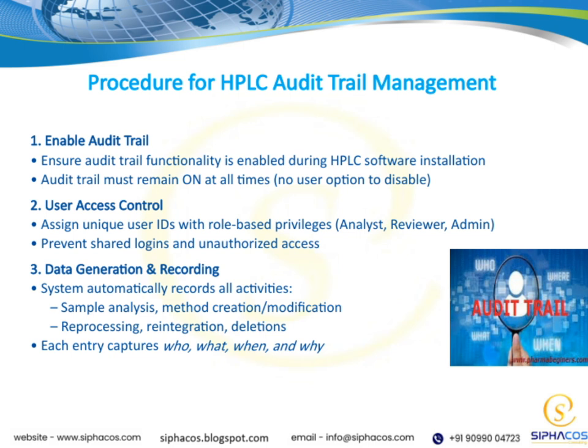Next, controlling user access is vital. Assigning each user a unique ID with role-based privileges, whether they're an analyst, reviewer, or admin, helps us manage who can do what within the system. This also prevents shared logins and unauthorized access, which could compromise the data or the process.